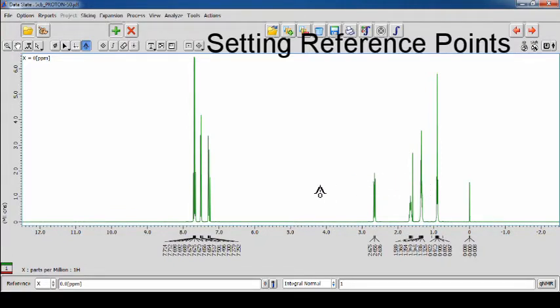For ease of use, the option to zero or set the reference to the solvent literature value is given here. Zeroing is done by pressing either the Z key or pressing the 0 next to the parameter box.